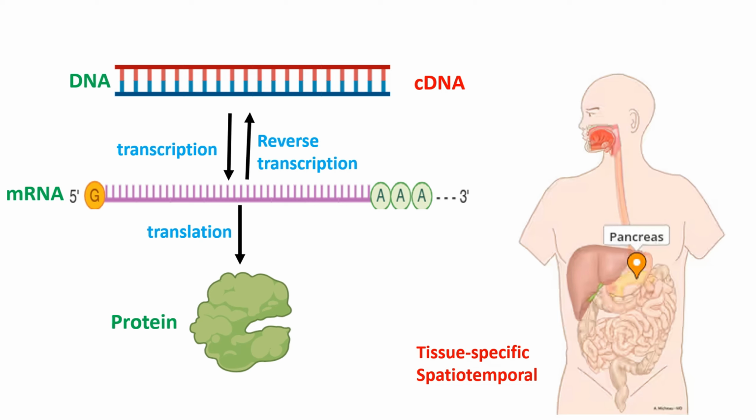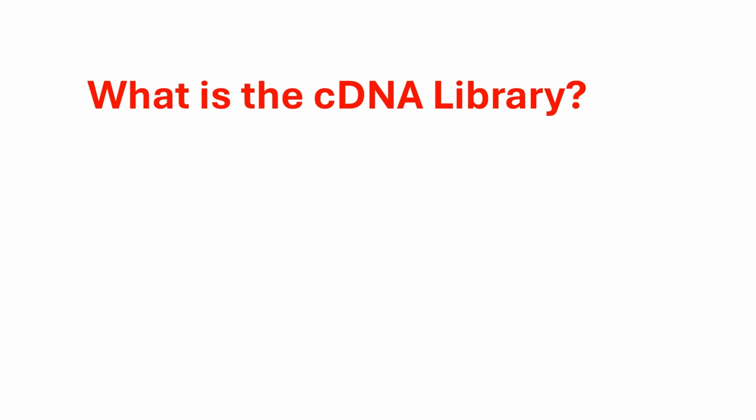So let's delve deep into how the cDNA is obtained and how the cDNA is used for the library construction. That is the real business for the day. Before then, let's get familiar with the meaning of cDNA library. In my previous video on DNA library, I defined what a DNA library is.